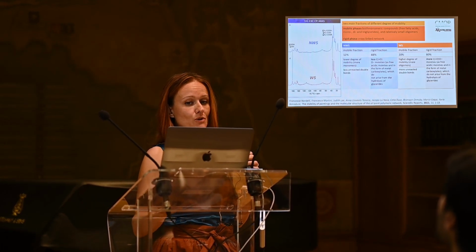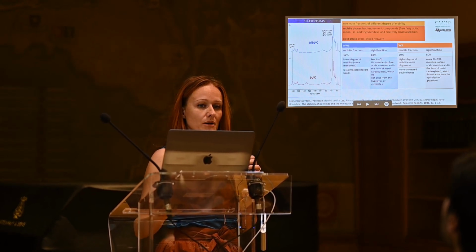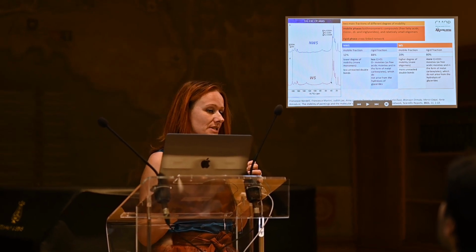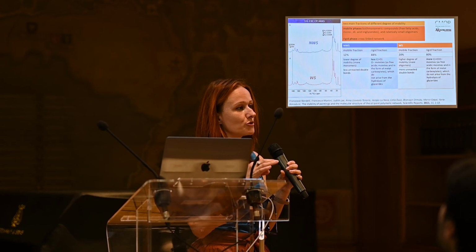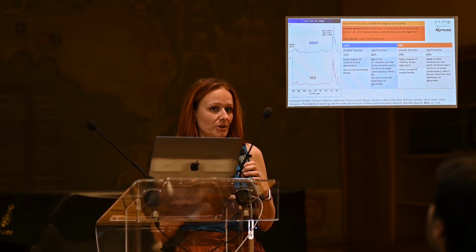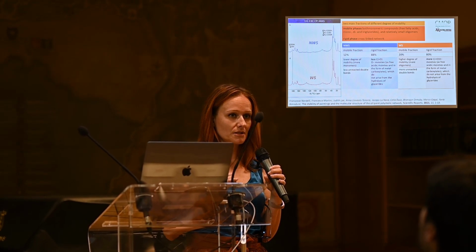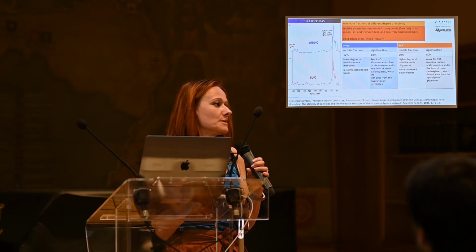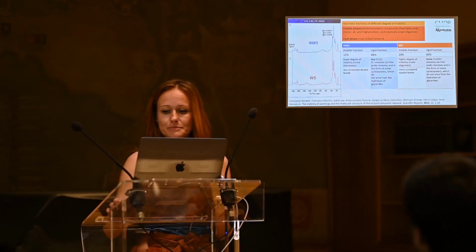And also, in the rigid fraction, we have a higher amount of acidic moieties. And those moieties are acidic or in the form of metals, but they do not come from the hydrolysis of the polymeric net, of the triglycerides, but they are new acidic moieties. So the cross-link fraction of the water-sensitive sample is more oxidized than the non-water sensitive sample.